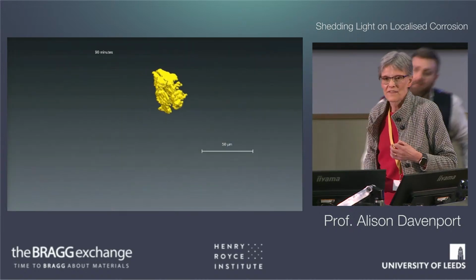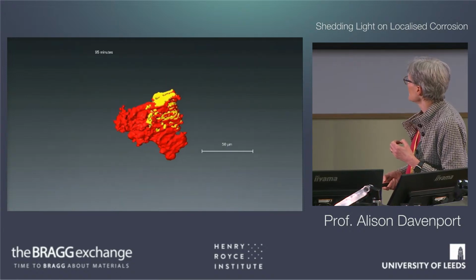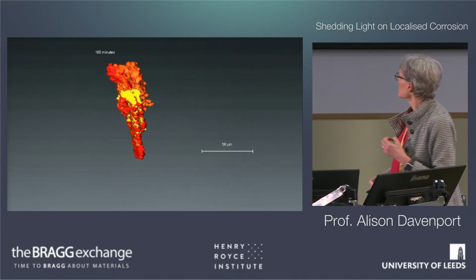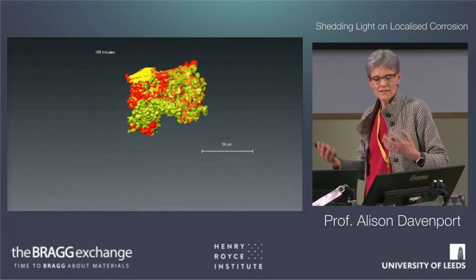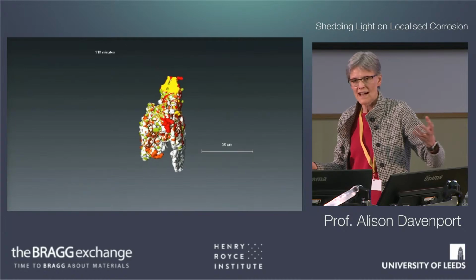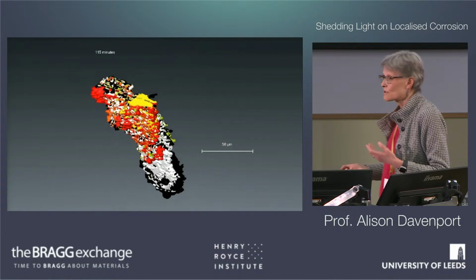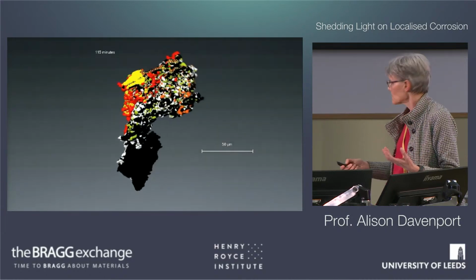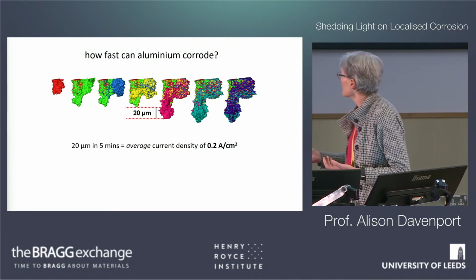So the other video, you can see that's number 1, that's number 2. You can see this big lobe coming out here. And then as you see these gradually develop, you'll see how tremendously variable it is, which bits burst into action and which bits decide they're not going to change at all. So you can see through the course of this quite a lot of varying development of this particular structure. So let's think about the implications of this.